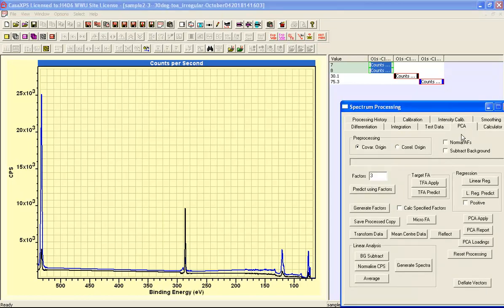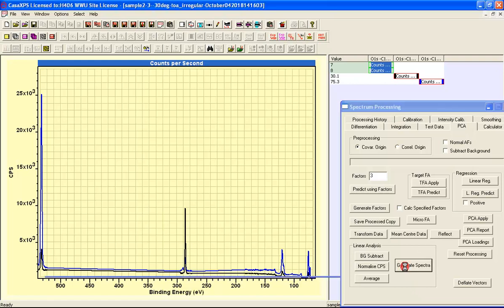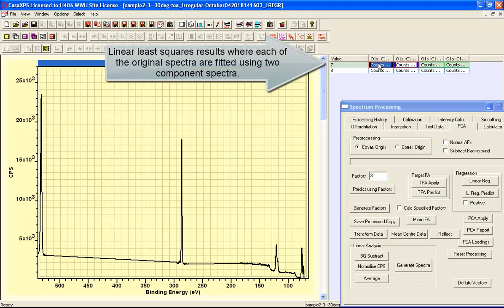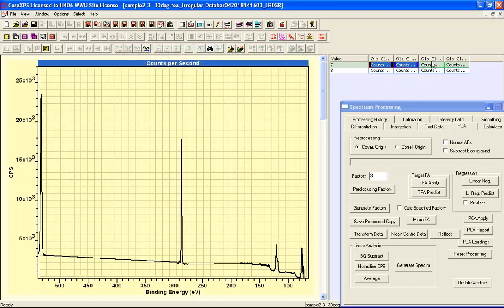Then using the PCA property page, generate spectra, we end up with a least square solution that is an exact solution because of the nature of how these were calculated. I can now simply display the original spectrum overlaying with these two component spectra.